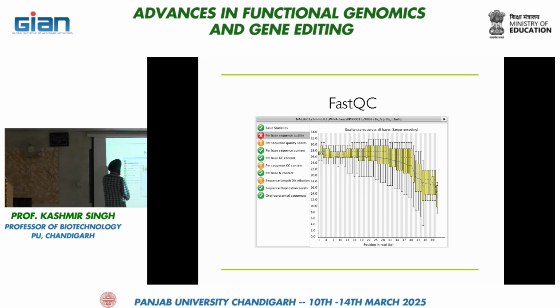So you can see in the beginning you have very good Phred score in terms of yellow lines. So you have 28, between 25, 30, and the moment it goes to the end, your Phred score plot widens up. That means there is some kind of problem in sequencing. So by looking at this graph only, you come to know how much trimming you require. So here you can see up to say 30 you have quality that is more than 24, and then you are going down. So you cut from here, you cut these fragments.